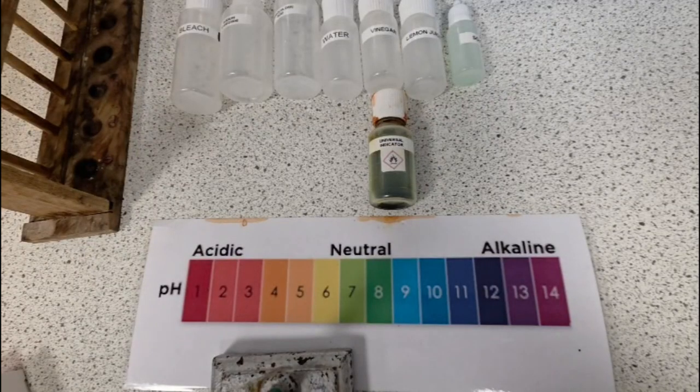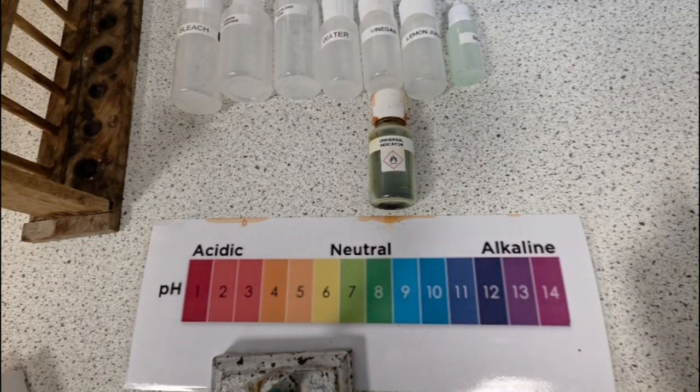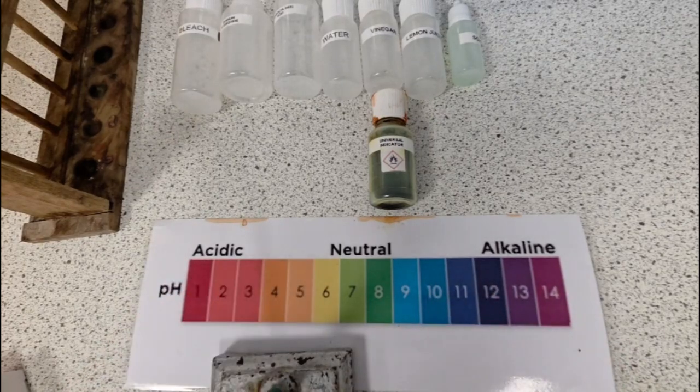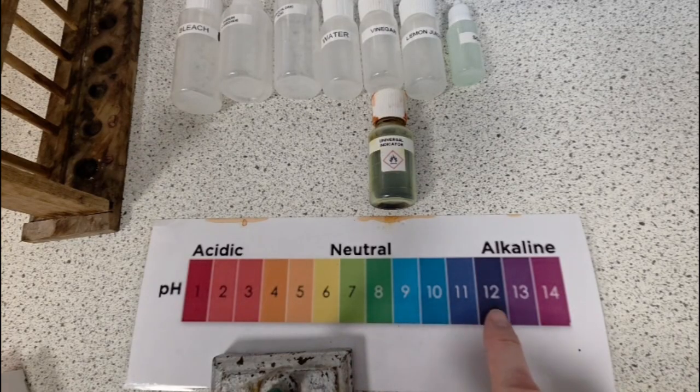What we're going to be looking at now is universal indicator. Unlike litmus indicator, which we used in a previous video, universal indicator can change a range of different hues and colors. And the color it turns tells you how strong the acid or alkali is. Whereas litmus paper simply goes blue for alkali and red for acid, the universal indicator will go through gradual changes in color depending on how strong the acid or alkali is.